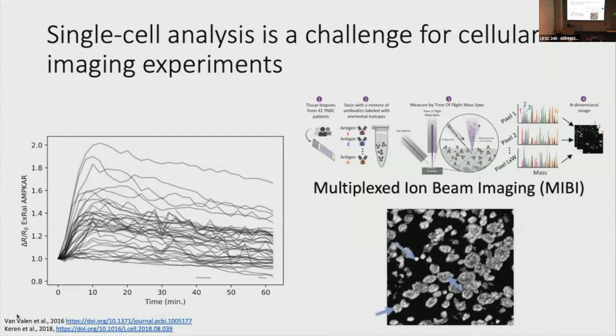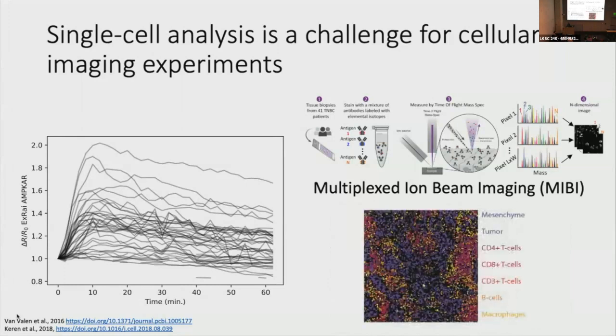And so some person or some algorithm has to go through these datasets and identify, okay, these pixels belong to cell number 1, cell number 2, et cetera. If you can do that, then all these downstream things start to become accessible. Cell phenotyping, looking for spatial patterns, tying these to outcomes and whatnot. And so really the two computational primitives here are, for the live cell imaging, cell segmentation and tracking. For the tissue imaging, it's both nuclear and whole cell segmentation.